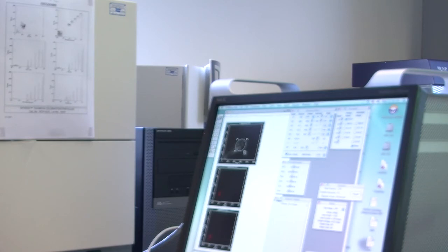Good. Well, whoever the first person's tubes are, plenty of cells. Yay! Well done. I can't see which one that is, I think it's Christy, I think. Excellent. Good. Plenty of cells. Christine's done this before though. So. Right. Experience, eh?